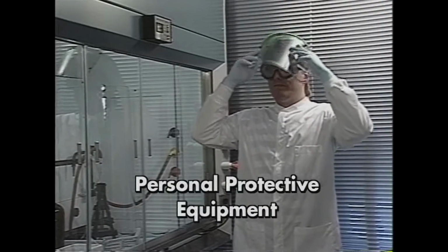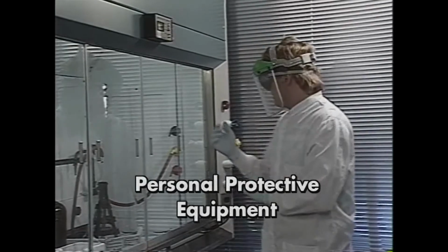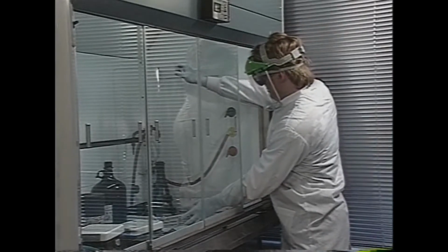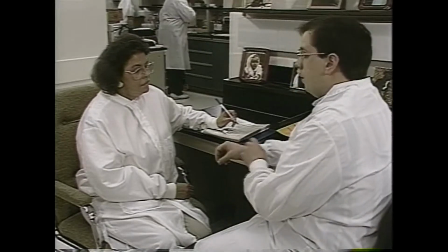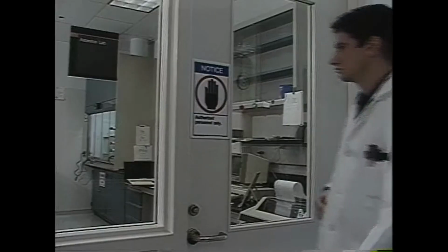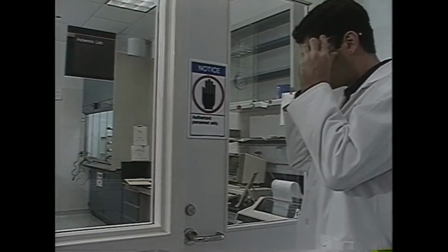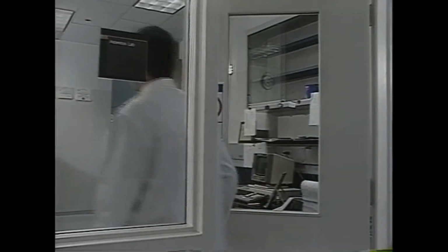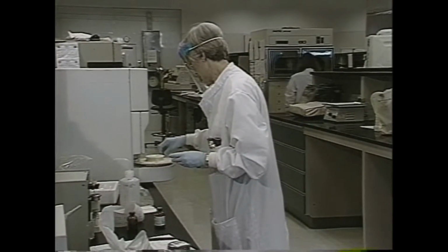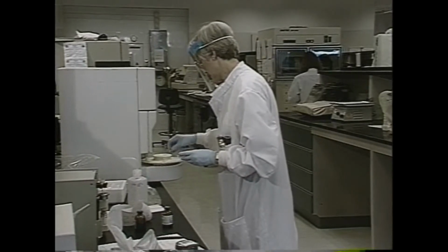Personal protective equipment is your last line of defense against exposure to hazardous chemicals, but it must be the first thing you take care of whenever you enter the lab. If you are ever uncertain as to what protection to use, consult your chemical hygiene plan or ask your supervisor. Guessing about PPE can have serious consequences. Safety glasses are usually the minimum requirement for eye protection in the laboratory. Work involving corrosive liquids or other splash hazards may require splash-proof goggles or the addition of a face shield.